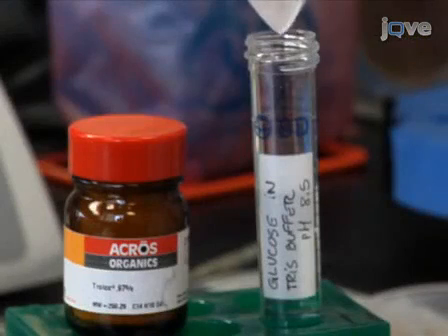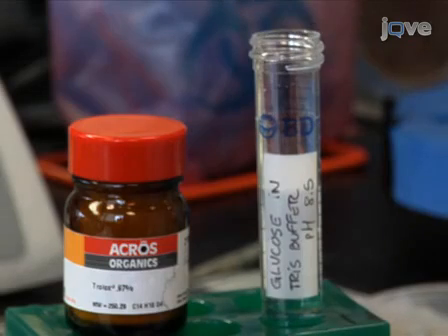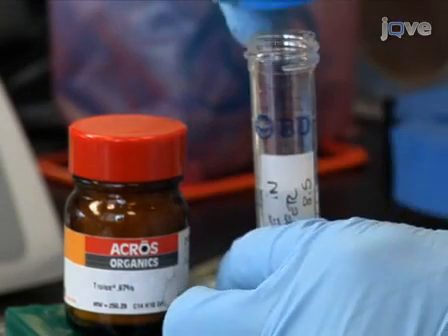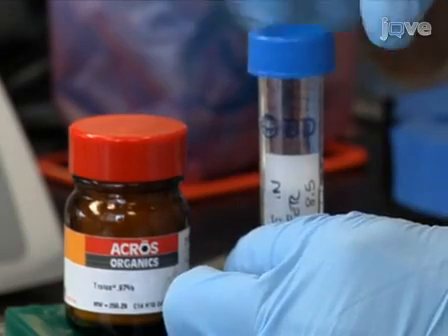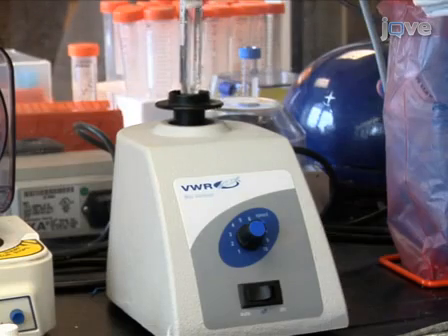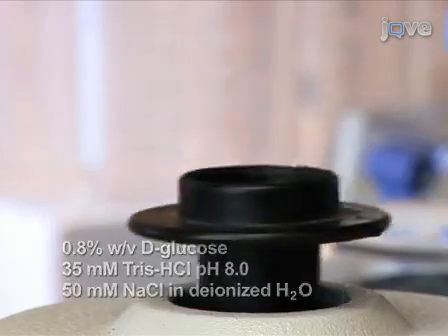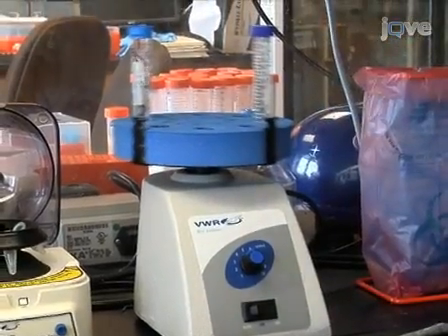The imaging buffer, or IB, consists of an enzymatic oxygen scavenging system and a triplet quencher such as Trolox. To make the IB, first dissolve 5 mg of Trolox into 10 milliliters of glucose buffer by vortexing for a couple of minutes and shaking for at least 10 minutes.